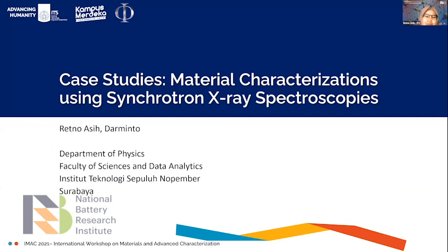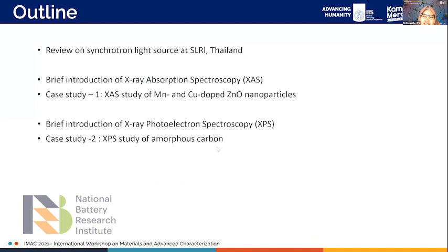So I'm Retno Asih from Institut Teknologi Sepuluh Nopember, and the presentation I would like to deliver today is about a case study of how we use synchrotron X-ray spectroscopy to characterize materials. I think some of the audience already has a lot of experience using these facilities at SLRI. So here I would like to share my experience of how to apply for beam time and also analyze the data.